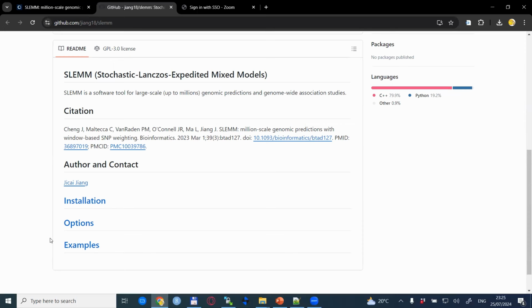Now I have to admit that for me it was a bit of a challenge to run this software. I found out a way to do it via trial and error. Therefore, it can be that there is also another way to run things, especially running the compiled executable files as opposed to the Python scripts that are provided. I will talk about this more later. But for this demonstration, I decided to go with the version of the pipeline that worked for me.